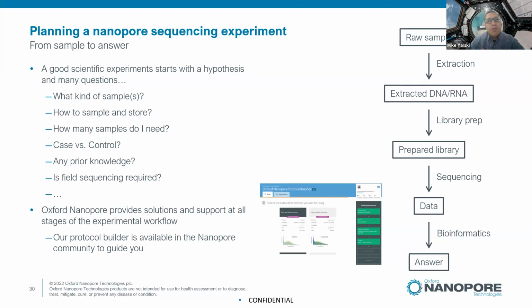Our libraries do not perform uniformly because a lot of our libraries are native DNA. It's just a fact of nature. So it's just going to our websites, talking to myself and the rest of the technical team and understanding how you can overcome some of these challenges. And there are some challenges for some non-model organisms, especially with avian species, which I'm sure you can talk to Annabelle Whitby. She will happily tell you some of her trials and tribulations sequencing birds.